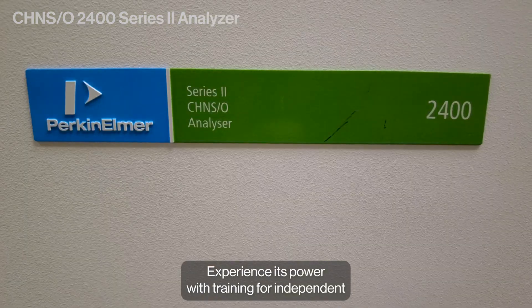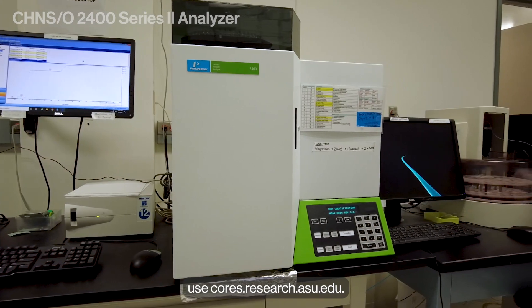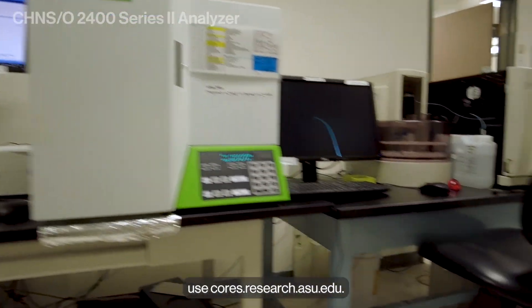Experience its power with training for independent use at cores.research.asu.edu.